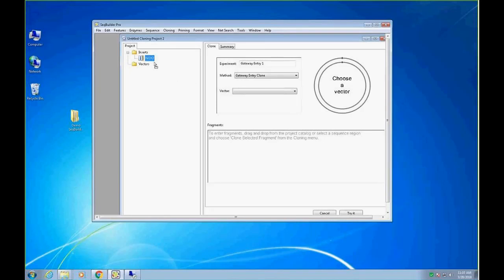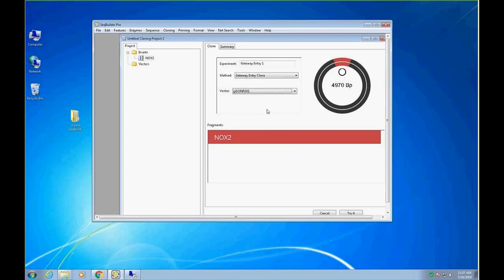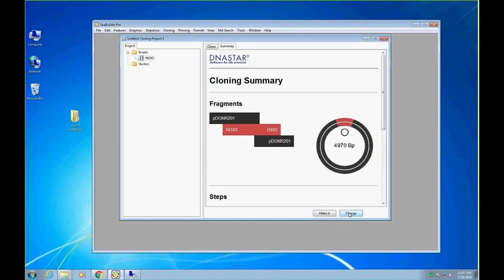Bring that in, and in this particular case, if you make a mistake and don't load the correct vector in, which is pretty common, where you don't quite know what the vector is. I'll make this window a little bit bigger here. Okay, so we'll try this out, and we get this little summary.